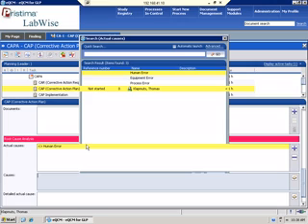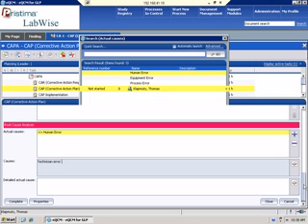And so here you can define what the actual causes are. And it's, you know, technician error or, and then if you want some more detail, again, you can define each of the steps.